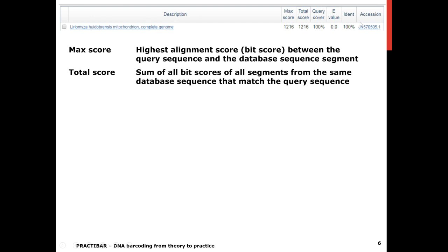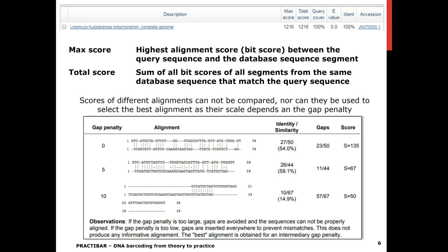Here again you see the top of the hit table. The max score is the highest alignment score — called the bit score — between the query sequence and the database sequence segment. The total score is the sum of all bit scores of all segments, because sometimes your sequence aligns to two separate segments and they each get a bit score; the total score is then the sum of those bit scores.